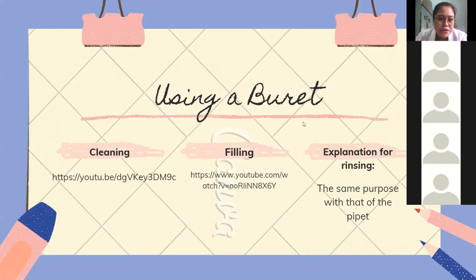Now, using a burette, please also take note of the videos, the links in your activities. I have provided there how do we clean our burette and how do we fill our burette. Now, doon sa filling na part, we also have a question, why do we need to rinse our burette with a solution to be used? Actually, it has the same purpose with that of the pipette.